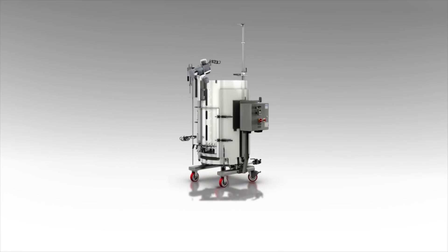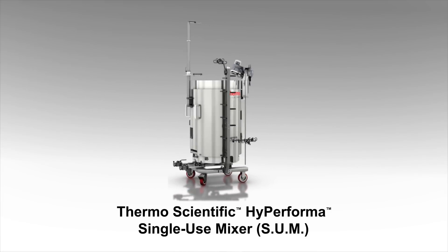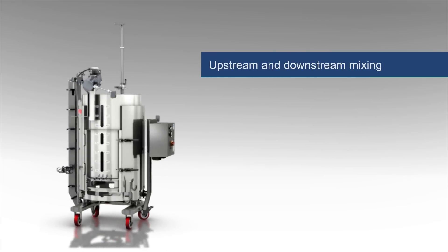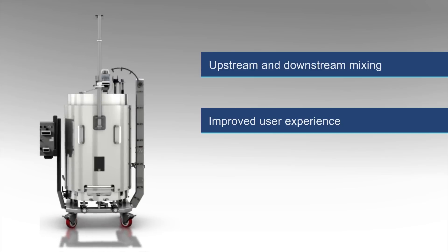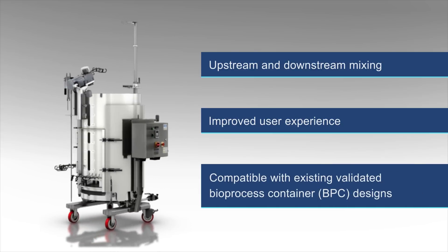Introducing the next-generation Thermo Scientific high-performance single-use mixer, or SUM. Built on a proven mixer platform designed for upstream and downstream mixing applications, the updated SUM offers an improved user experience while allowing for compatibility with existing validated bioprocess container, or BPC, designs.